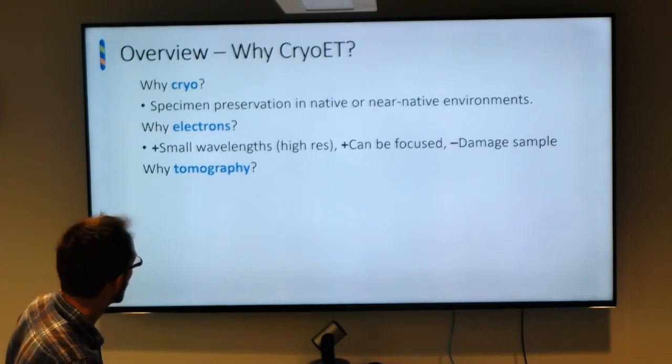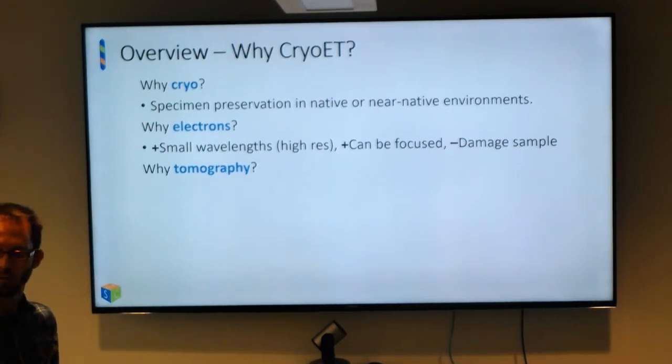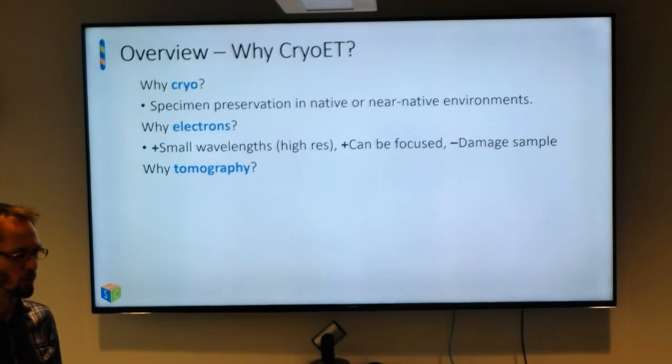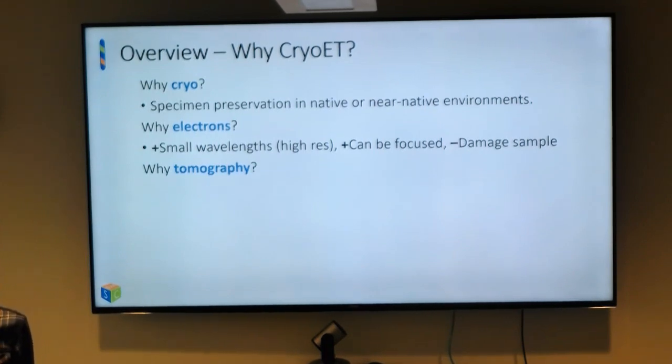Now I'm going to ask you, why would you do tomography? Like, what type of samples, if you put them in a microscope and you're like, oh, I can't do what I want to do, I need tomography. What type of samples can you imagine? I know some of you have projects with these types of samples, so in general, what do you think? If they're big or unique, then you can't average a lot of them. You only have like one. Yeah, uniqueness, good.